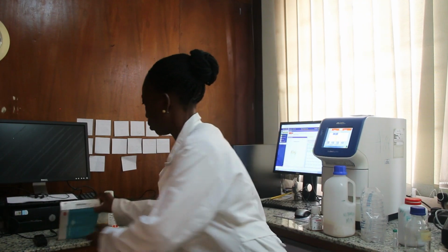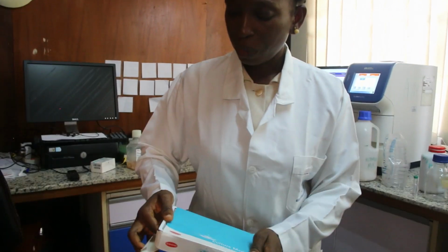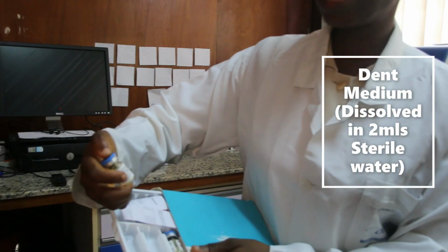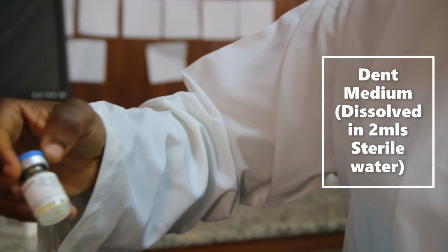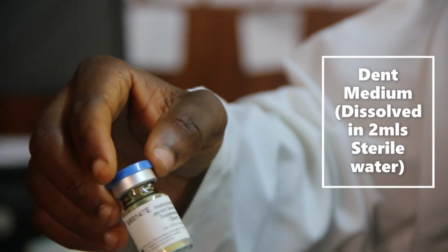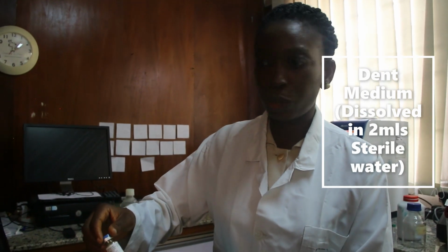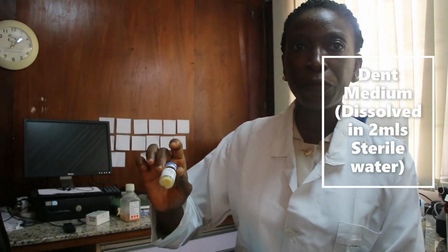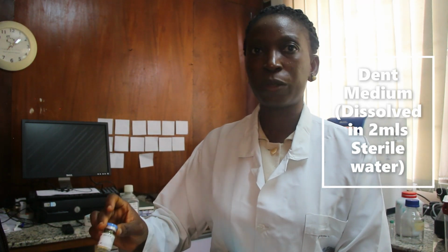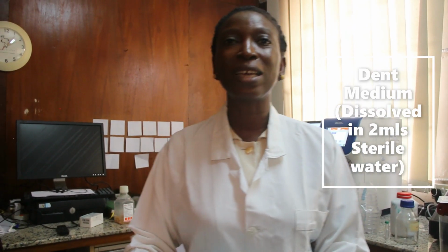And Dent medium, this is a product of Oxoid. It's an H. pylori selective supplement, also known as Dent medium, which contains vancomycin, amphotericin B, and other antibiotics to inhibit fungal growth or any other contamination. Because it is in powdery form, it will be dissolved with about 1 to 2 ml of sterile distilled water and then added to the mixture of the agar. This now becomes a serum plate.